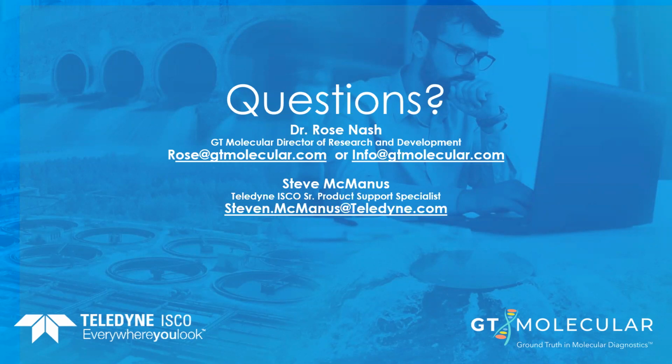No. So we actually really urge people not to compare from lab to lab at this time. As I showed in the presentation, there can be huge variations in viral recovery from sample to sample within a given day. And there are also huge variations in how much virus makes it through the analysis from protocol to protocol. So what we're urging the field to do right now is to consider adopting some harmonization controls, things like this bovine coronavirus that we use. If that was implemented into other workflows, like that polyethylene glycol concentration step I mentioned, it would really make it easier to compare from lab to lab and give us a more harmonized data set for the country. Because everyone's working with different labs at this point. But the answer to your question right now is we highly discourage comparing from one testing lab to another, just due to the inherent variability in the concentration step and the recovery from protocol to protocol.